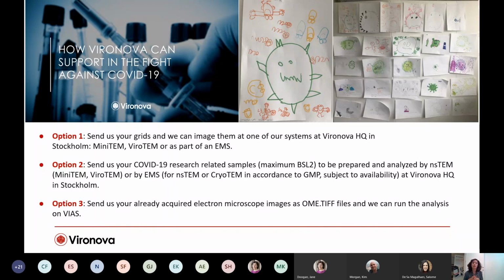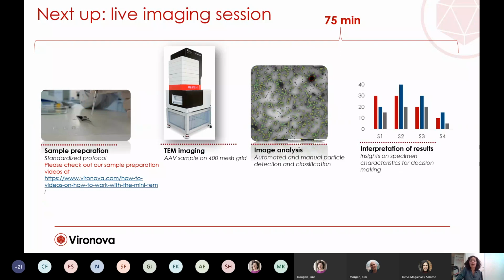So please, if you feel like you have something that you might want to analyze, do contact us or Salome, and let's see how we can help you. So on that note, I am finished with my presentation, and next up we will do the live imaging session.